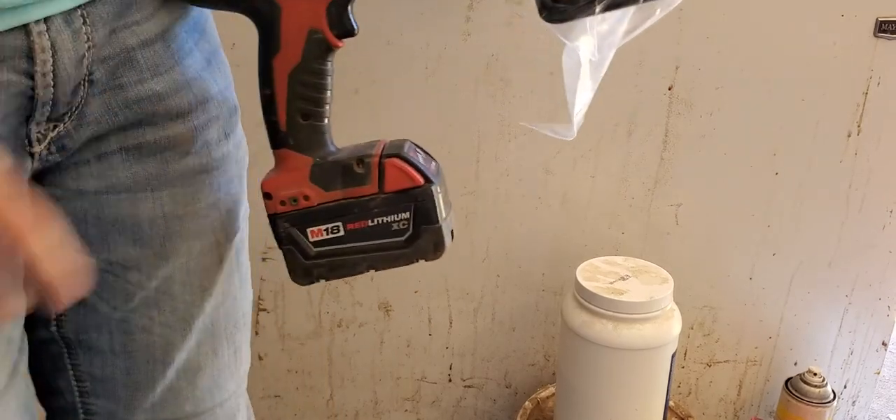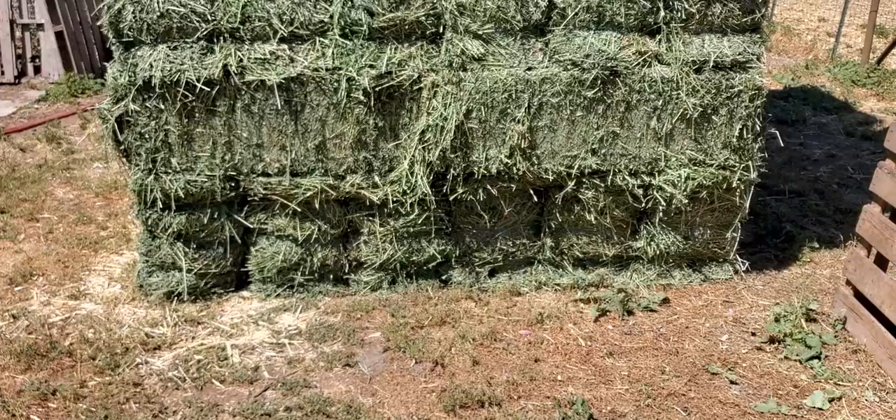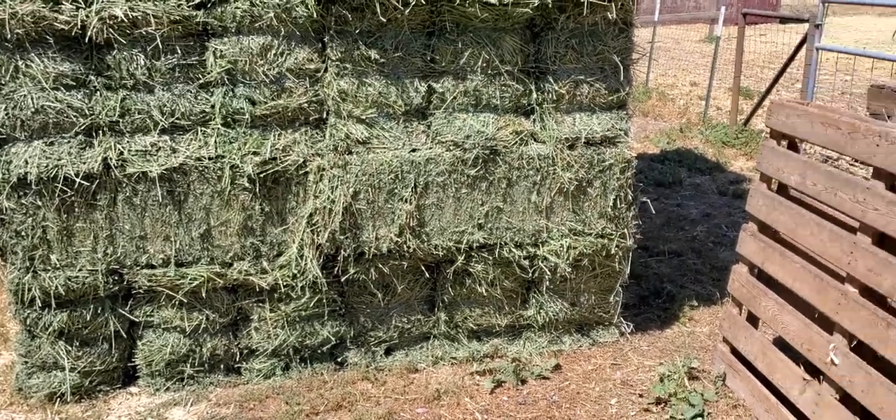I'm just going to put it on my drill here.